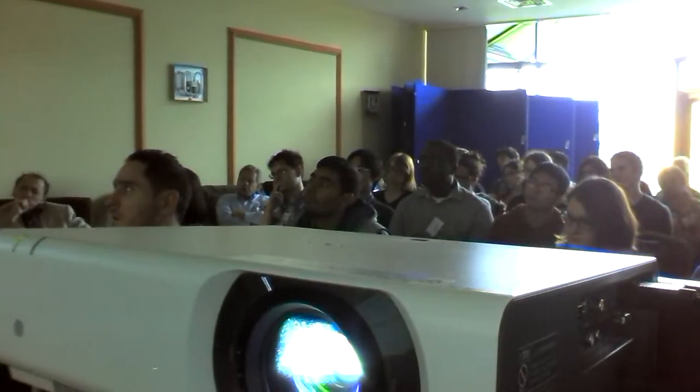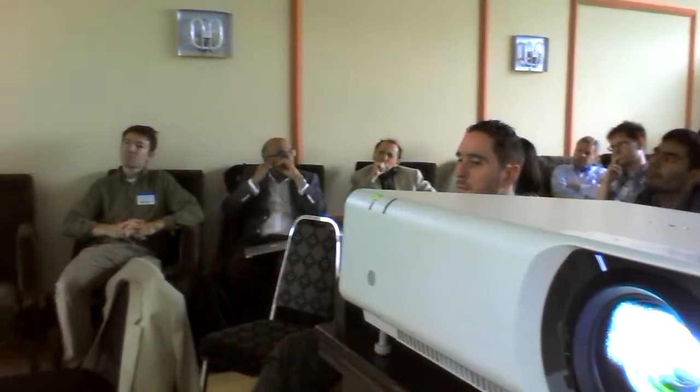Well, I don't have a lot of experience of adaptive optics, but of course plenty of people do. Martin Booth in Oxford, for example, is one where a lot of work has been done on using adaptive optics for confocal or multiphoton microscopy, and you can certainly get substantial improvements. So combining adaptive optics with some of these other methods might help. I know that people have used adaptive optics with STED. You could think that you could combine adaptive optics with lots of other things.